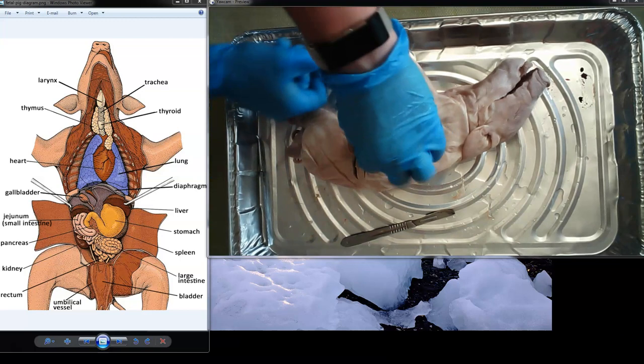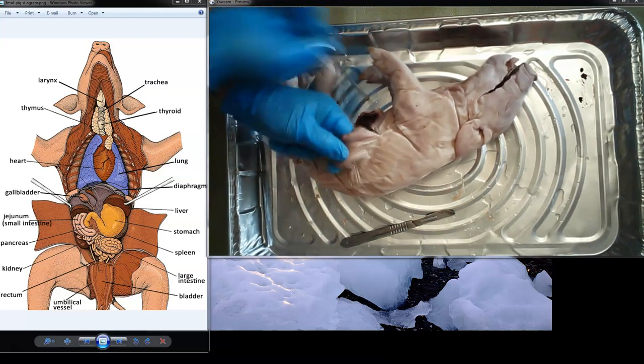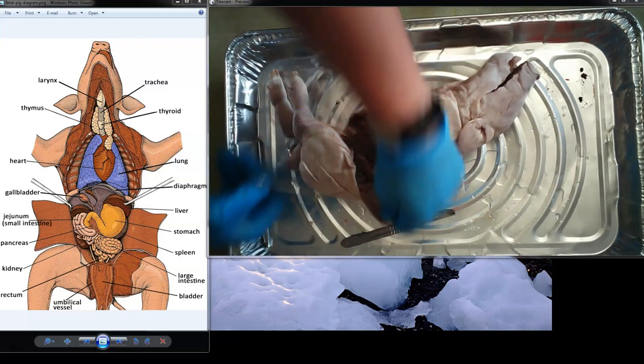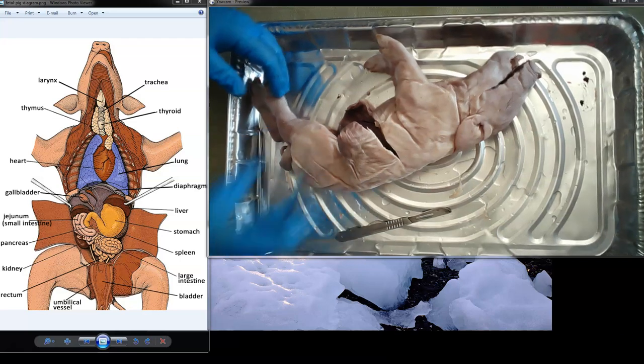I have kids with their hands up here, everybody, so I'm going to ask them what they want to ask. My daughter's questions tend to be not so much questions as just statements of what she sees. And my son, who also has his hand up for, I think, the first time, we'll see, fingers crossed, that it's a good question. Okay, guys, go ahead.